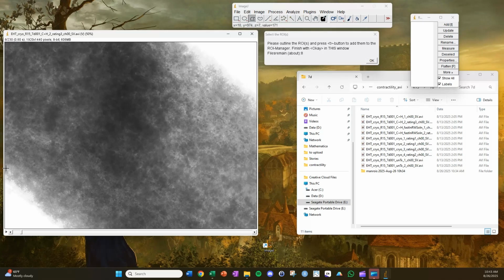And also sometimes it's unclear exactly where the tissue boundary is. Like, is it here or here? I always go on the safe side. So I'll count this sort of whitish area as empty space. So I'll start drawing here. Yeah, just be on the safe side of this. Yeah, draw something like this.